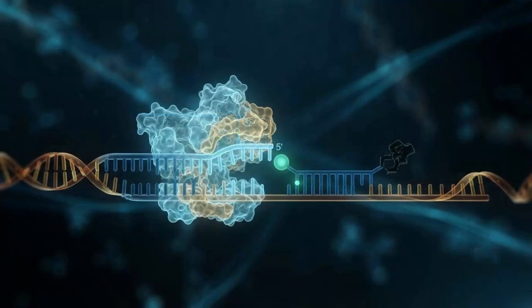Unlike primers, probes don't initiate DNA synthesis. Their job is simply to recognize and remain bound to the target sequence until polymerase reaches them.